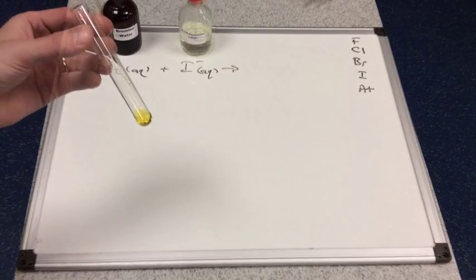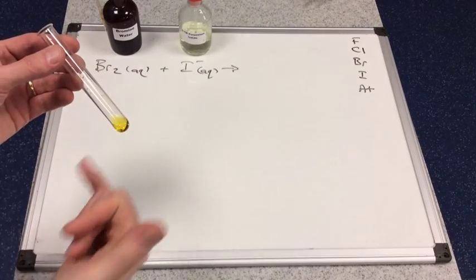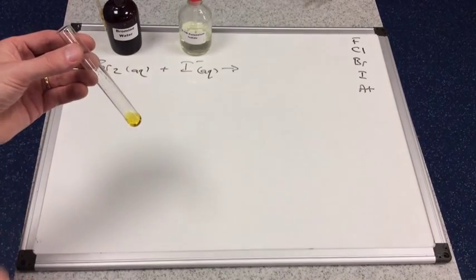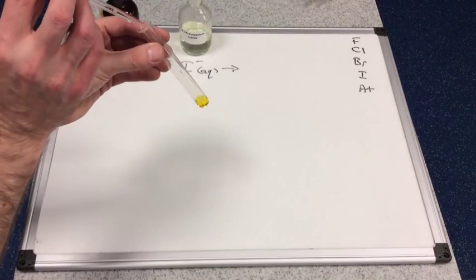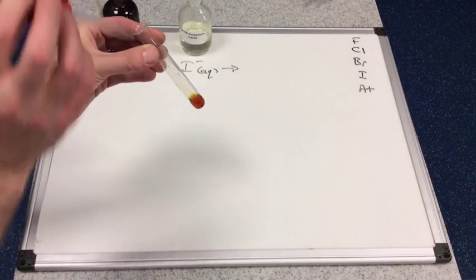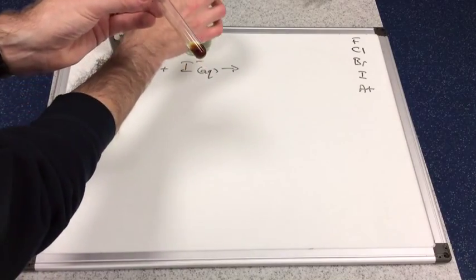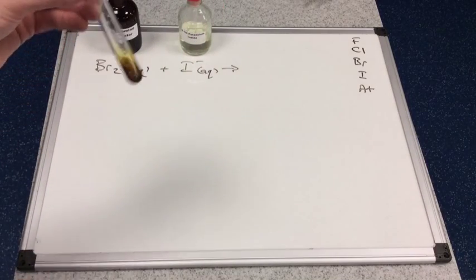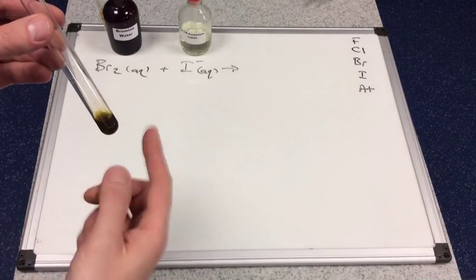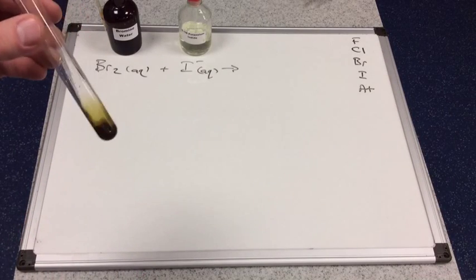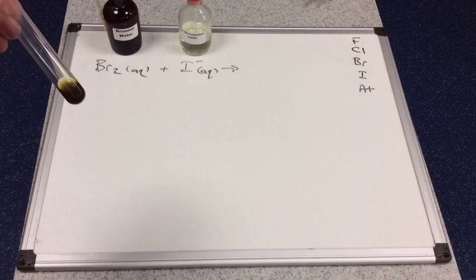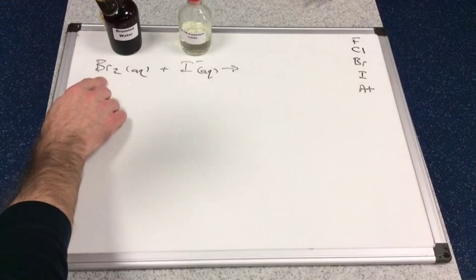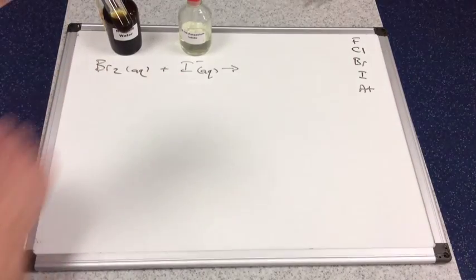I've got some bromine water in the test tube, so that's why I've got this yellow color. I haven't added the iodide yet. So let's get the iodide solution in. And there's been a color change, so there's been a reaction takes place. So it's got a sort of not a very nice browny sort of black color, but there's definitely been a reaction. So obviously the bromine has displaced the iodine.